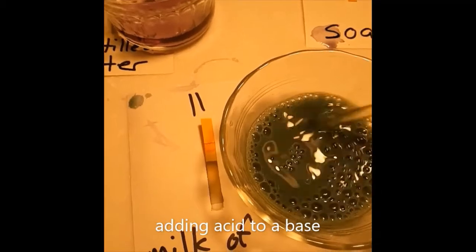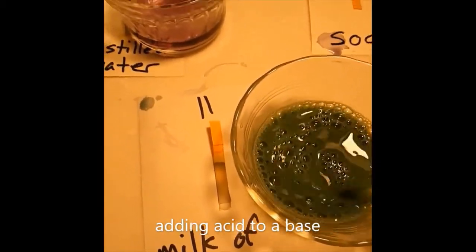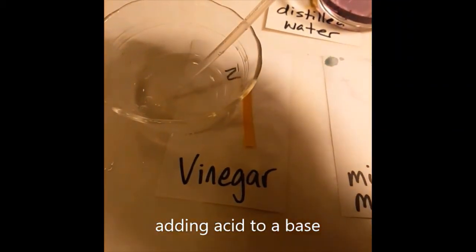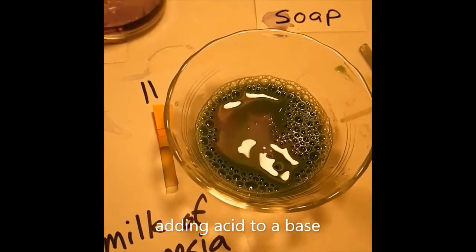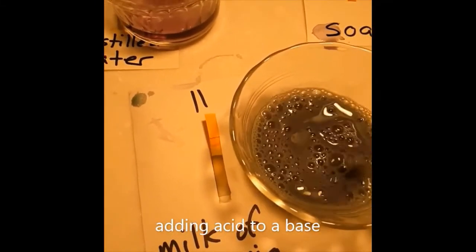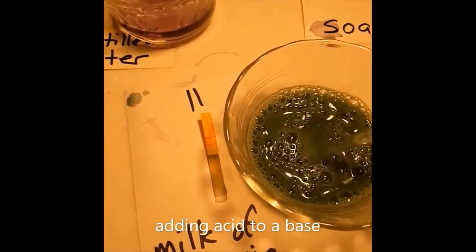Oh, it got purple, and then it kind of turned back to green once I mixed it up. So I think I need more acid. It's gotten less basic, but not all the way yet. Oh, that's pretty. Purple and green. Ooh, hey, the whole thing's purple. Whole thing is blue again. And back to green. Nice.